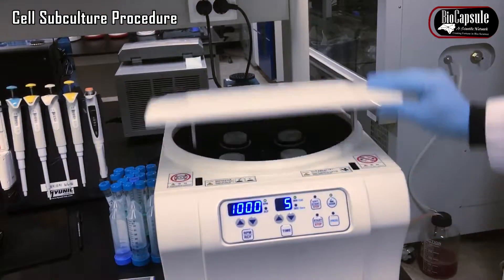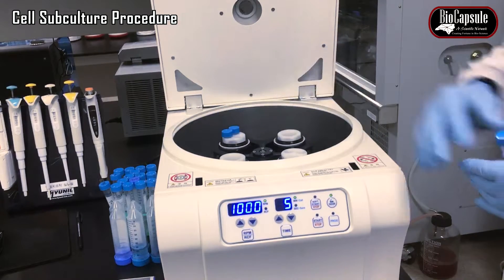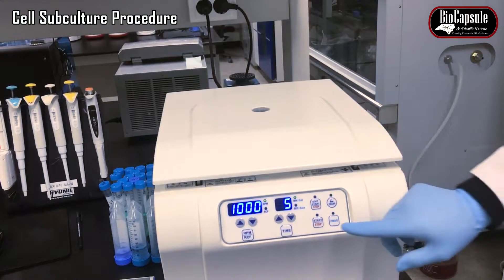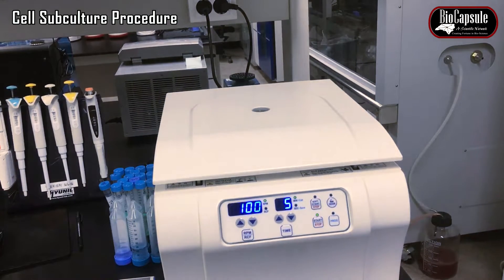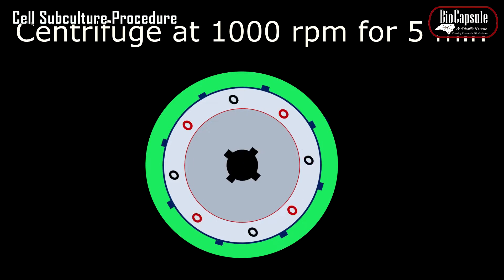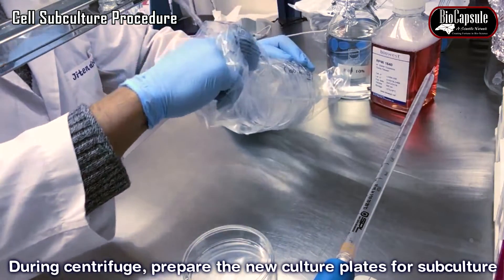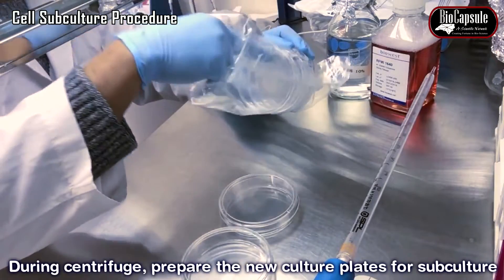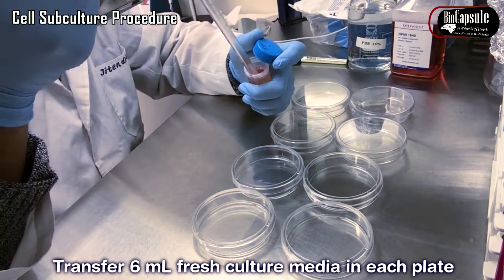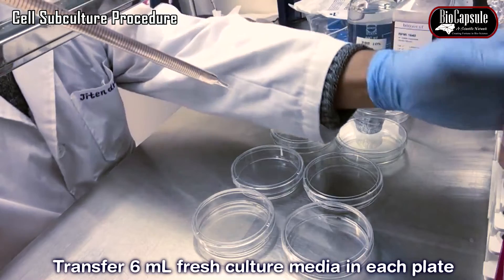Centrifuge the cells at 1000 rpm for 5 minutes. During the time of centrifugation, you can prepare the 100 mm dishes with medium. Add 6 ml of complete medium in each 100 mm dish for each culture plate.